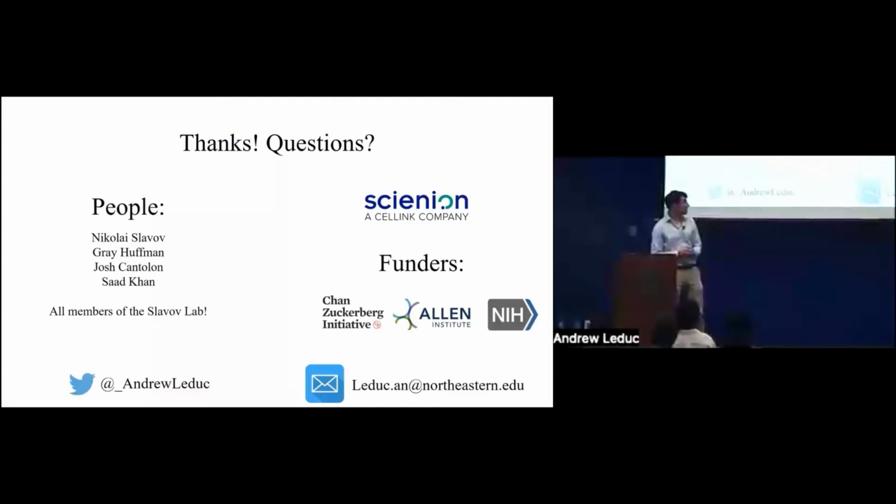That's a great question. So one of the benefits of increasing the throughput and providing additional parallelization to your sample preparation is that you have the potential for fewer batches that come from preparing cells on different days. And so, in terms of how to implement these batch corrections on your data, I think you can start by looking at things that you might know to provide potential sources of batch effect, and look at the variance due to some of these sources, such as samples prepared on different days or run on different instruments.